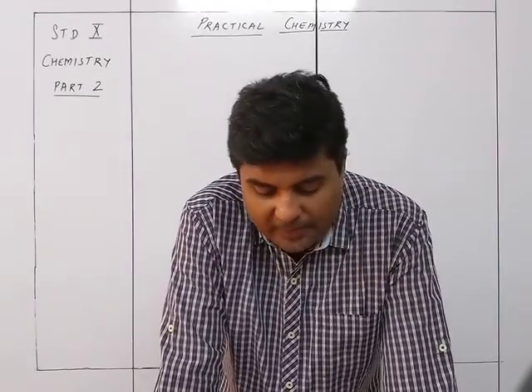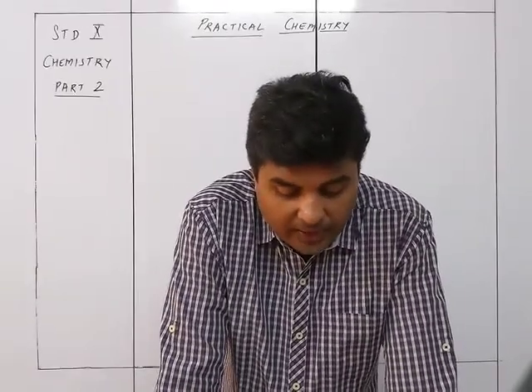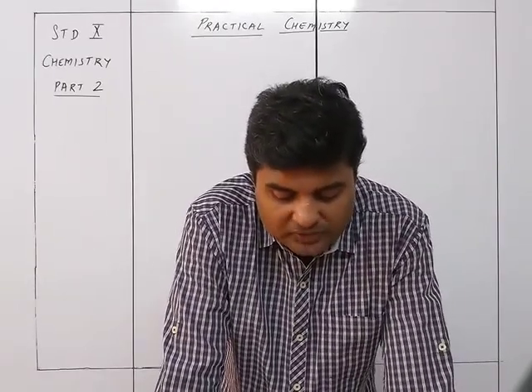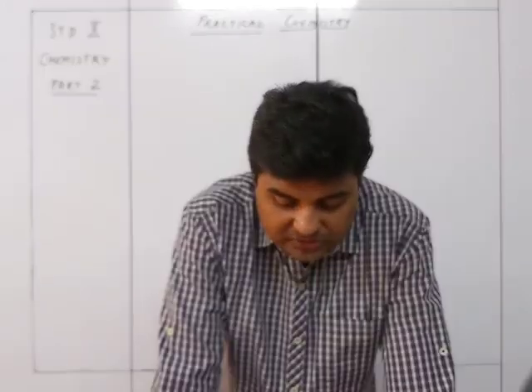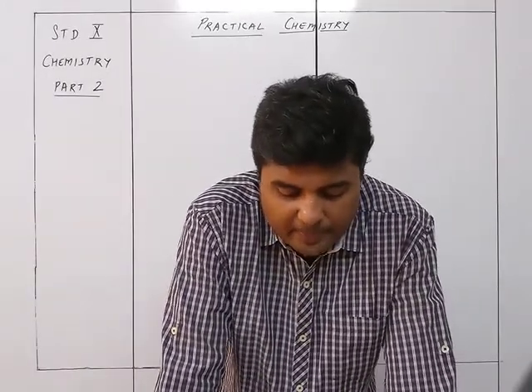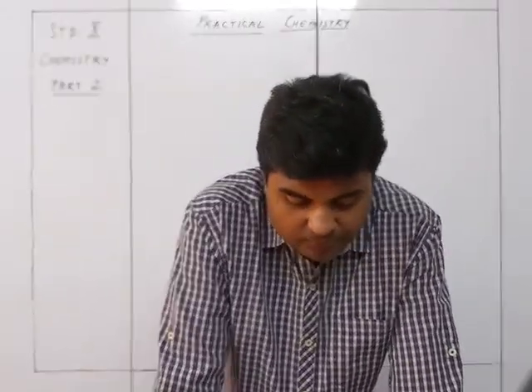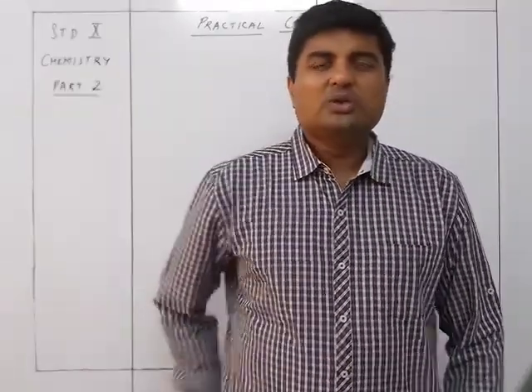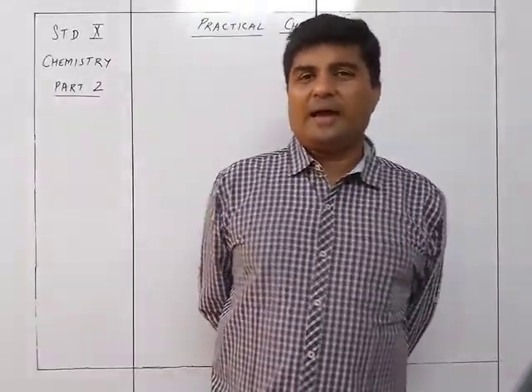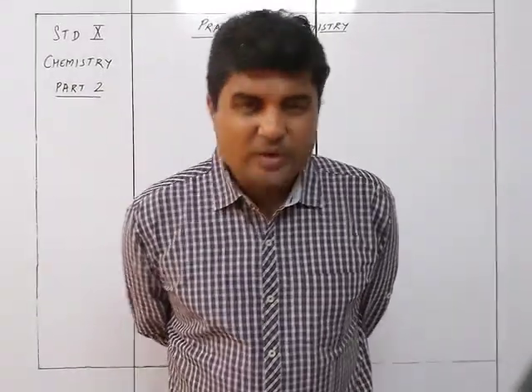The gas will be water vapor initially, and then it will be NO2 plus O2. Nitrogen dioxide is reddish brown, acidic to litmus, and turns moist KI paper brown, and oxygen is neutral and rekindles a glowing splinter. So these are the two tests which are going to be conducted on the gases which are given out. The gas will be reddish brown in color and the other gas will rekindle the glowing splinter. The residue will be zinc oxide.